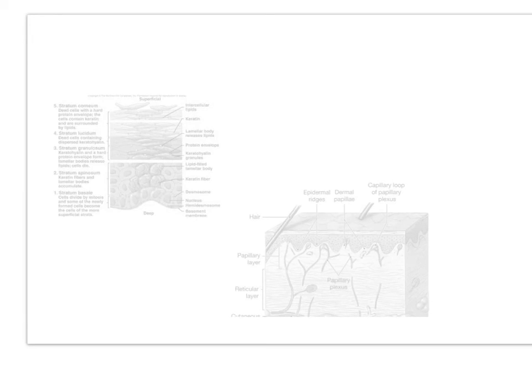Okay, so that's all we need to see for this slide. You can move on to the next one. But please first take the magnification back to the smallest magnification, so those lenses are furthest away from the slide, and turn your light off before you move on to the next one.